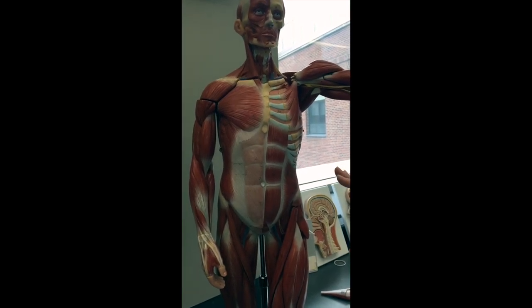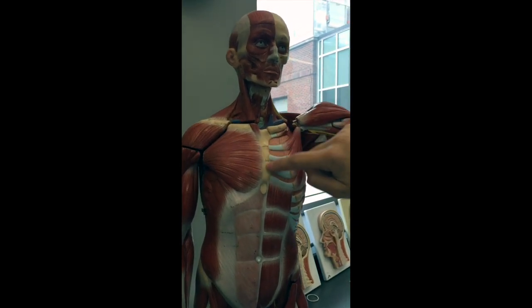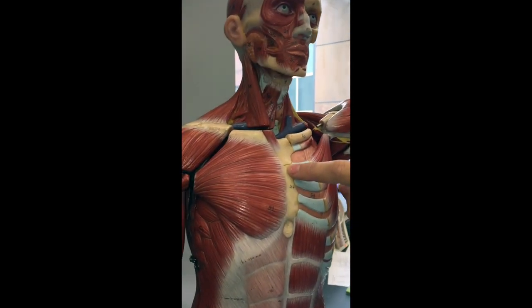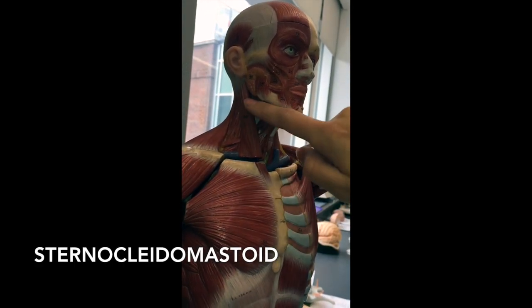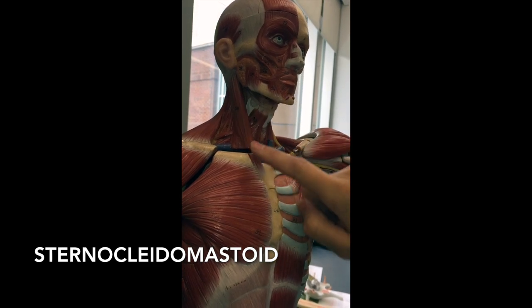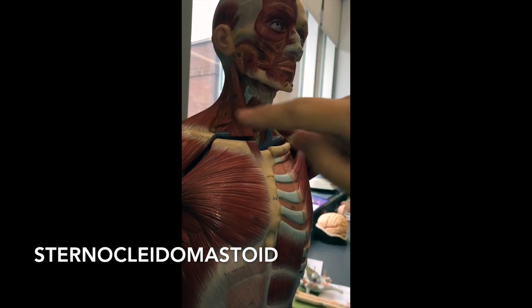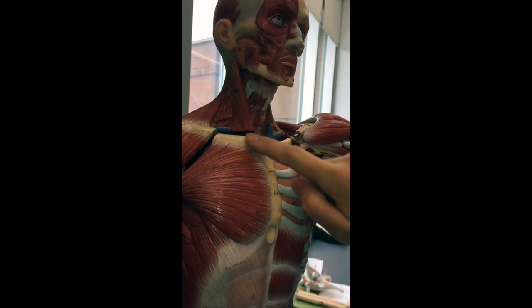Now we're going to do the neck and the chest. This muscle right here is connecting — the sternum, you guys should know that bone — connecting our sternum up here to the back behind our ear, which is the mastoid process. So this is going to be the sternomastoid muscle, also called the sternocleidomastoid because it connects to the clavicle too. So it's the sternocleidomastoid, this muscle right here.